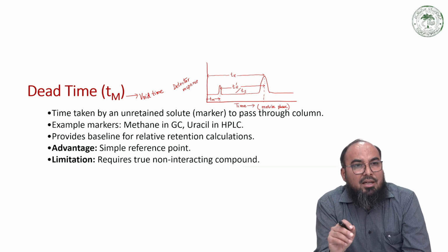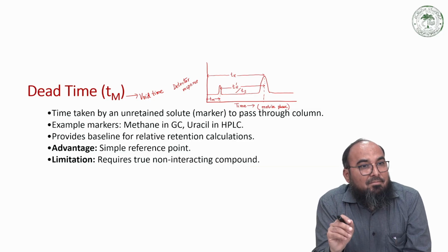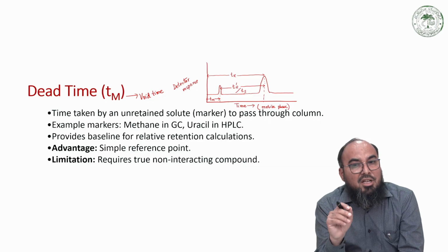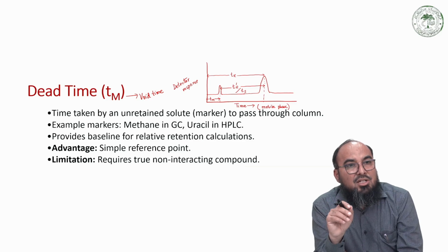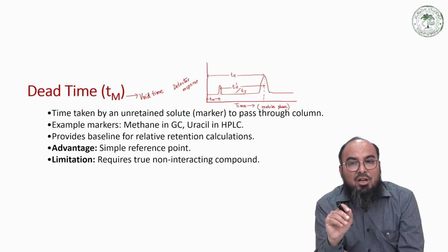It is the standard, like, for example, in NMR we call it TMS. So in chromatography, the TMS can be equated with the Tm. Now you record all your responses with regard to Tm, because Tm is the time taken by the mobile phase, which does not contain any of your analyte. That is for your neat mobile phase, neat solute, which you have initially passed through the column.